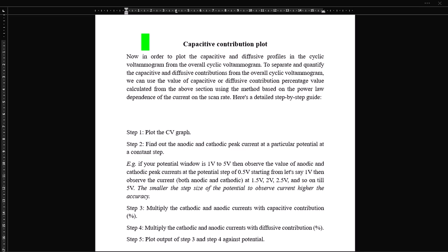In order to separate and quantify the capacitive and diffusive contribution from the overall cyclic voltammogram, we can use the percentage values calculated from the previous section using the method called the power law — specifically a modified power law — which describes the dependence of the current on the scan rate. Here is a step-by-step guide on how to plot capacitive and diffusive profiles in a cyclic voltammogram.